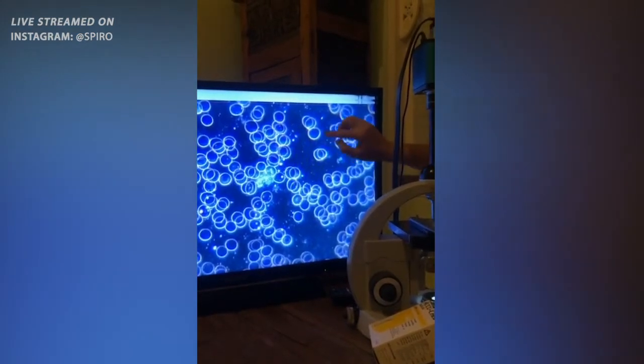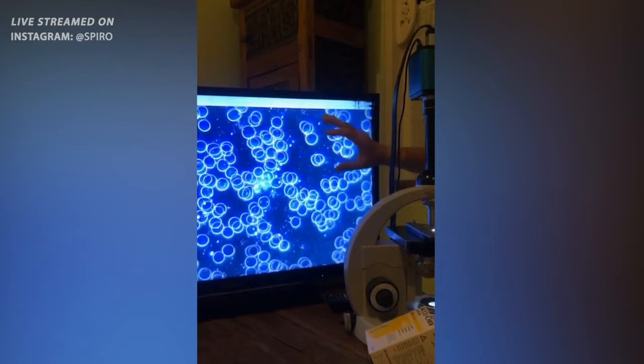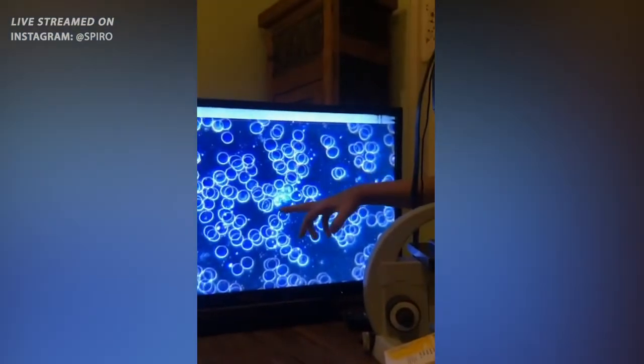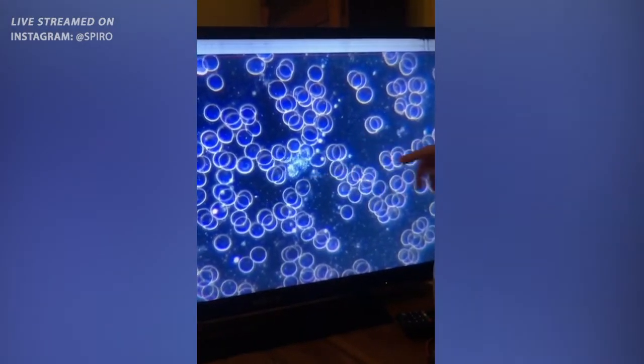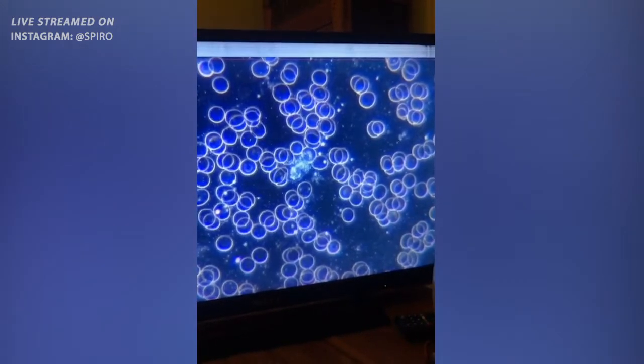These are our red blood cells, and we're aiming here that they're really round and separated, so one by one. These are the white blood cells, the leukocyte, and you can actually also see there is movement in the cell, which is really important that they're active. Yeah, so this is important to see.